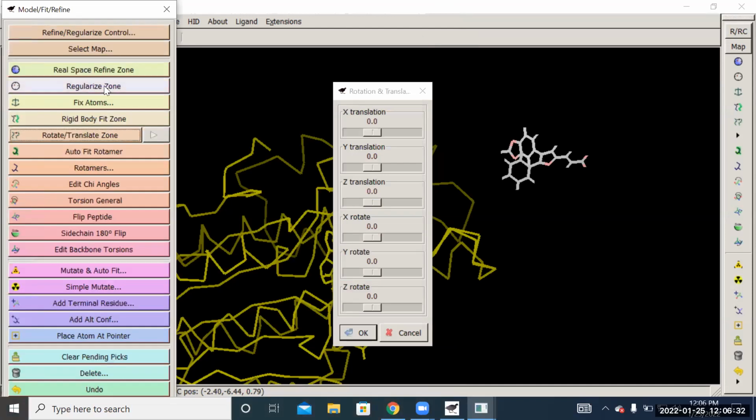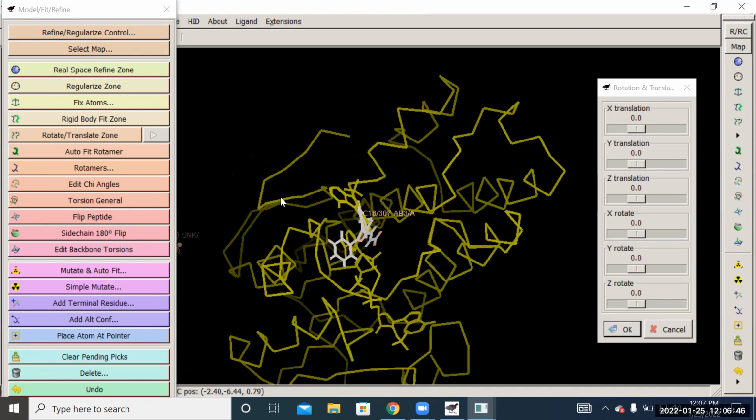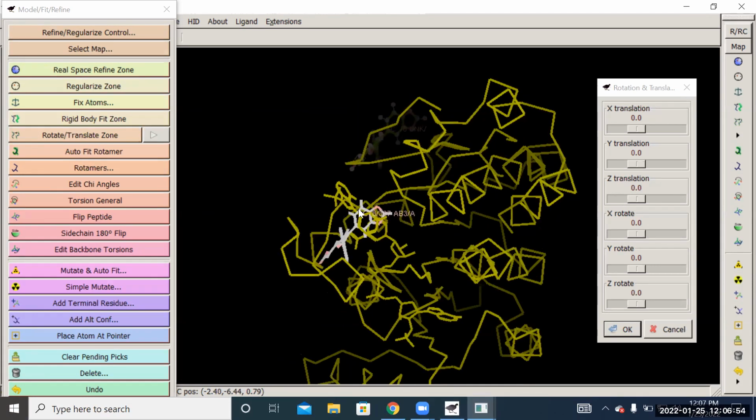All right. So I want to move these windows out of the way, and I'm going to move this guy to where I'm hoping I want to put it. Then you kind of rotate around, and actually I got lucky there. Now, I'm not going to do all the moving, but you can fine tune it and move it around. You can also do rotation with these sliders. You see how I do that? You can rotate in the different angles, and a lot of the fine tuning is going to be involved there.